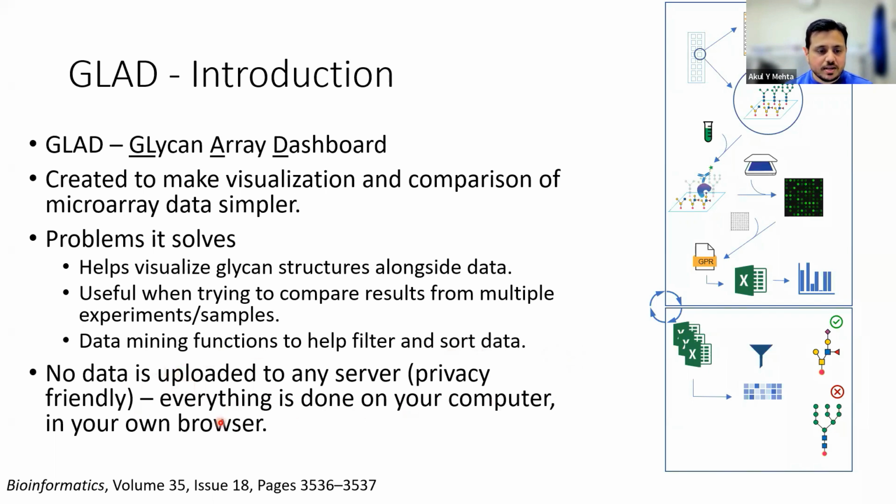One more thing to keep in mind is this is a web-based application, so you can actually open the browser and use it, but none of your data is uploaded to any server. So it is kind of privacy friendly, because your data still remains on your browser only. It does not get uploaded anywhere, and everything is done on your computer in your own browser.